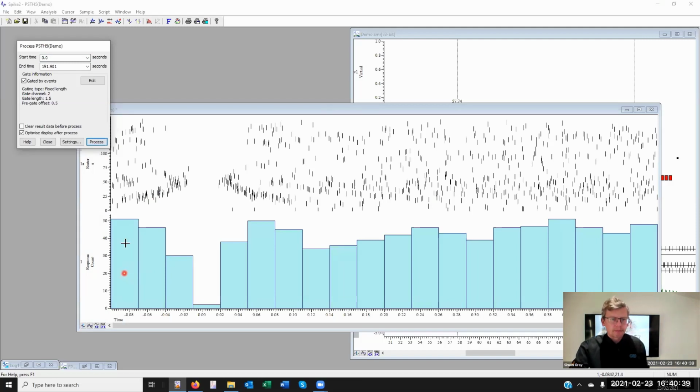As you can see, stimulus histogram. Ideally, we'd have no events at the time of stimuli. In this case, because the bin width is fairly broad, I'm getting a fairly low count of events. Following that, the bin's showing you the count of the number of spikes that fall within that bin, and above that, raster data showing us on a sweep by sweep basis the distribution of the events in each sweep.